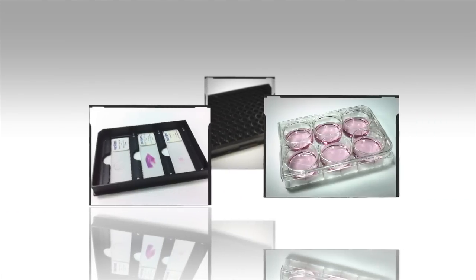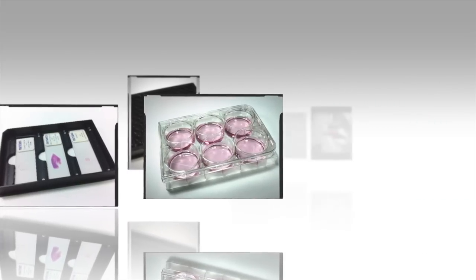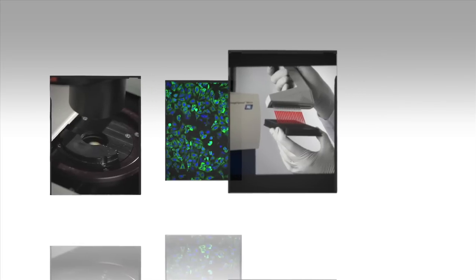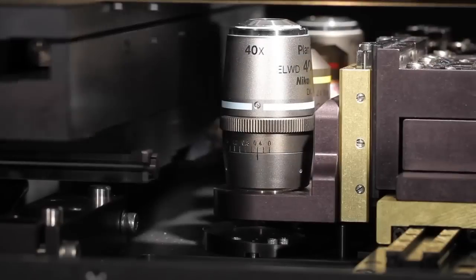Imaging samples can come in a variety of plate types, or even on slides. To accommodate different plates, some objectives have a correction collar which can compensate for the thickness of the plate bottom.